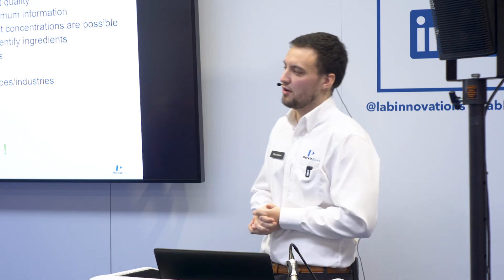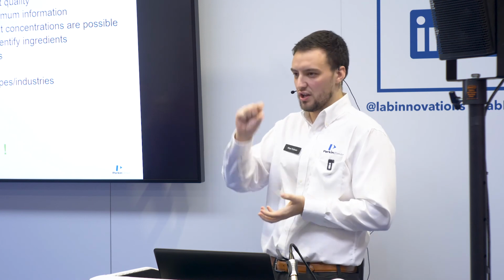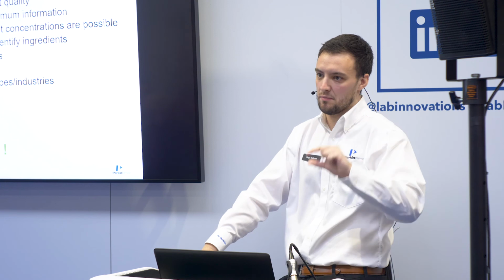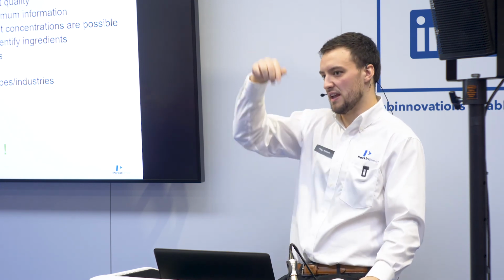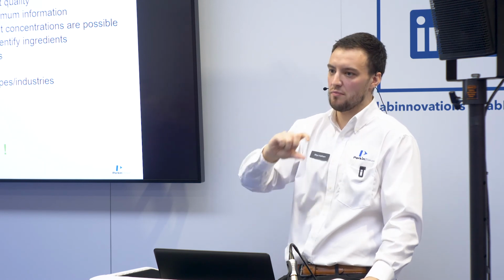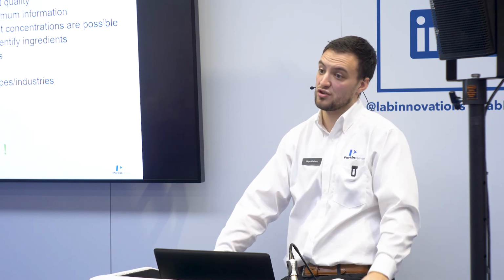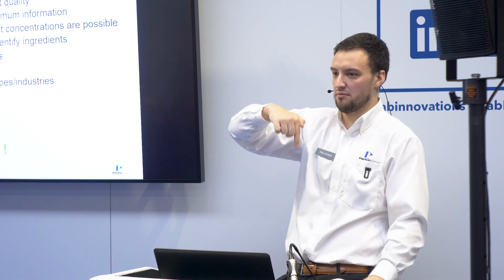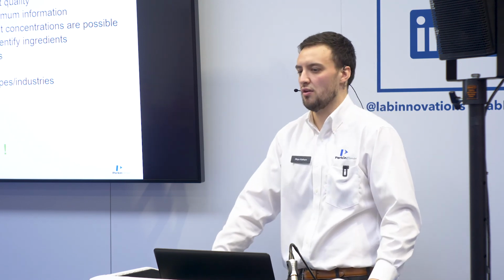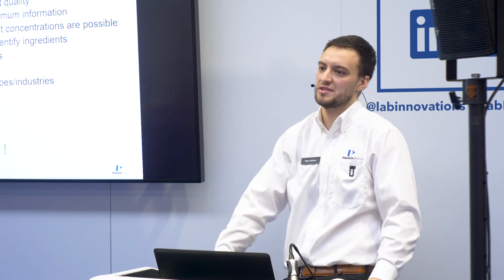Yeah, so it depends on how you do the analysis. So as I mentioned, for transmission, it will go right through the sample if you have about a centimetre in terms of the thickness of the sample. Whereas reflectance, so are you familiar with diffuse reflectance? Yeah. So you'll get a few microns, again, it will depend on your sample, but you'll get a few microns penetration in your sample because the beam will come down, it will penetrate through, and it bounces around through the molecules to then come back up. So you obviously, depending on your sample, you will get more information sometimes by going deeper.